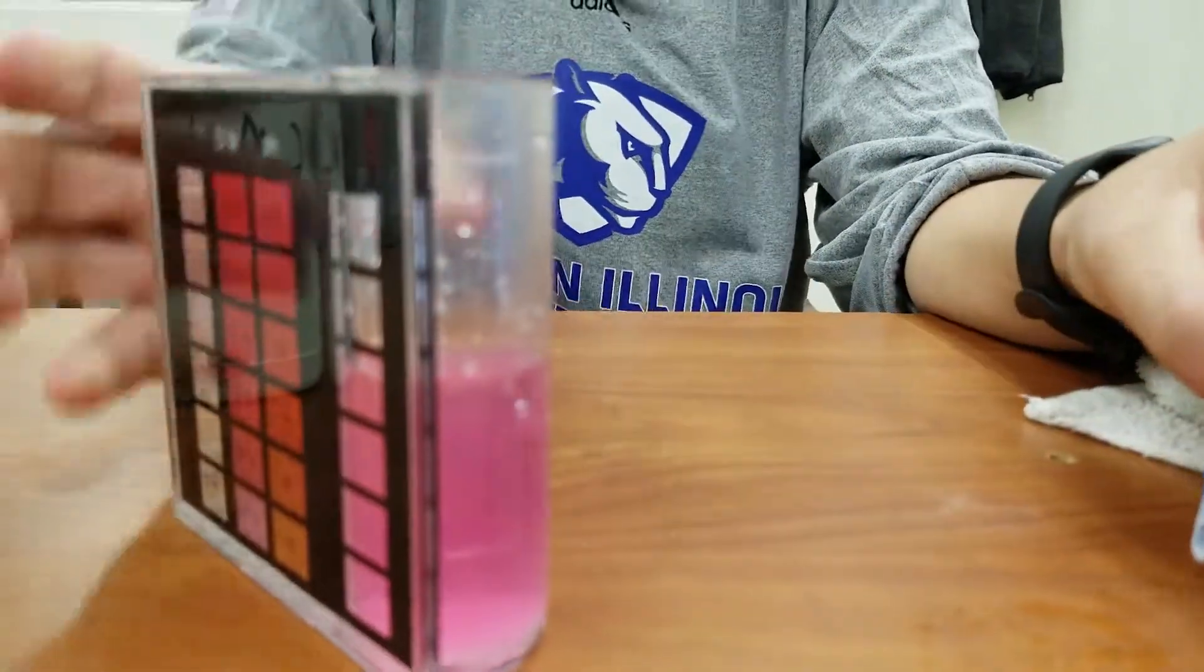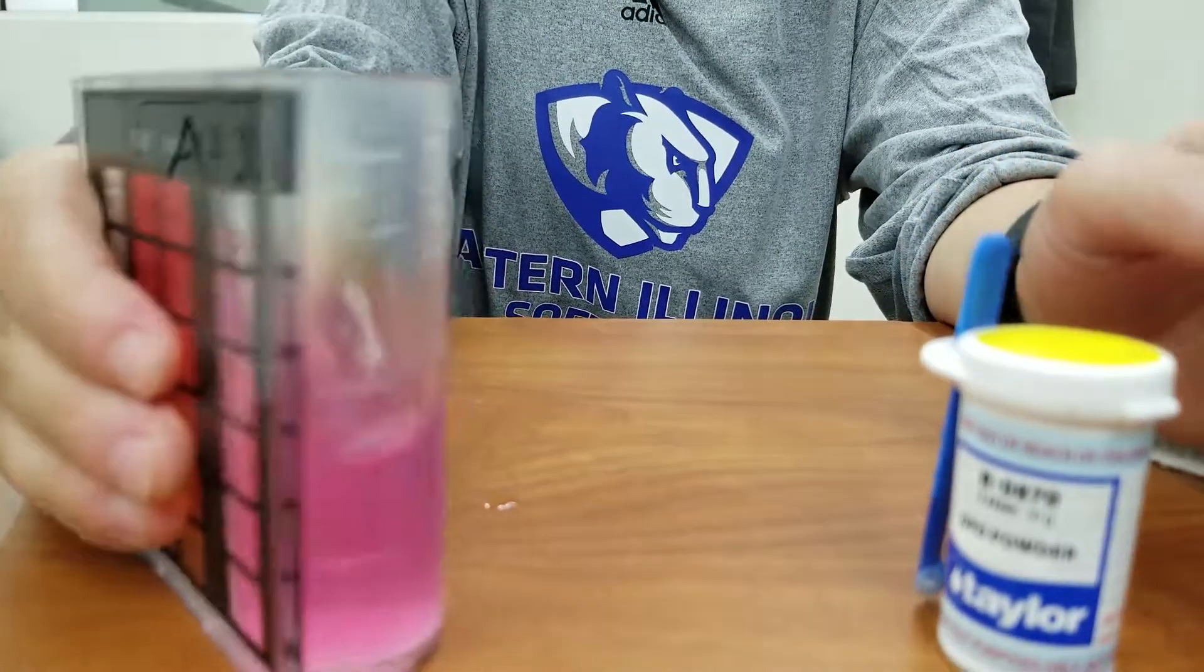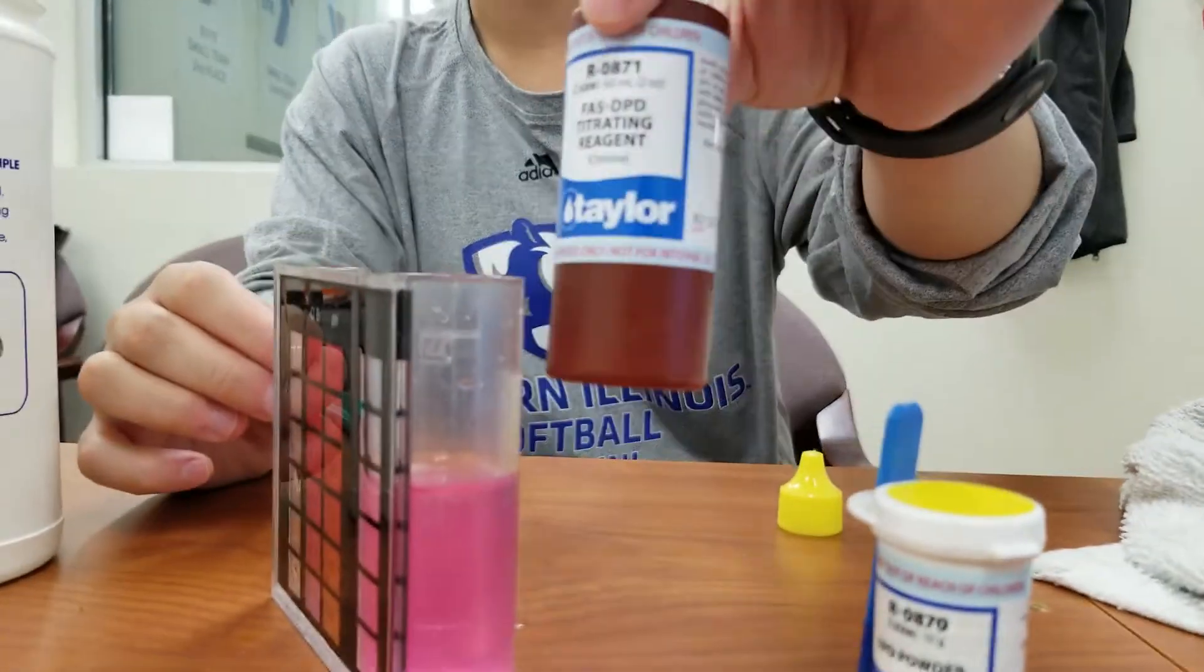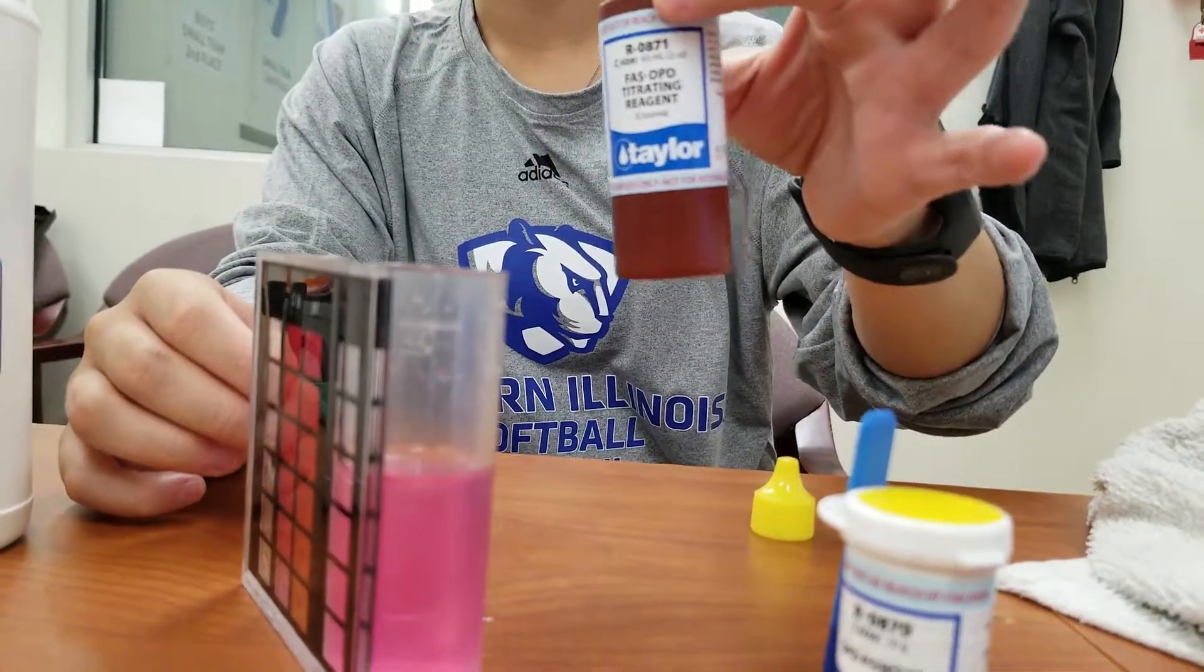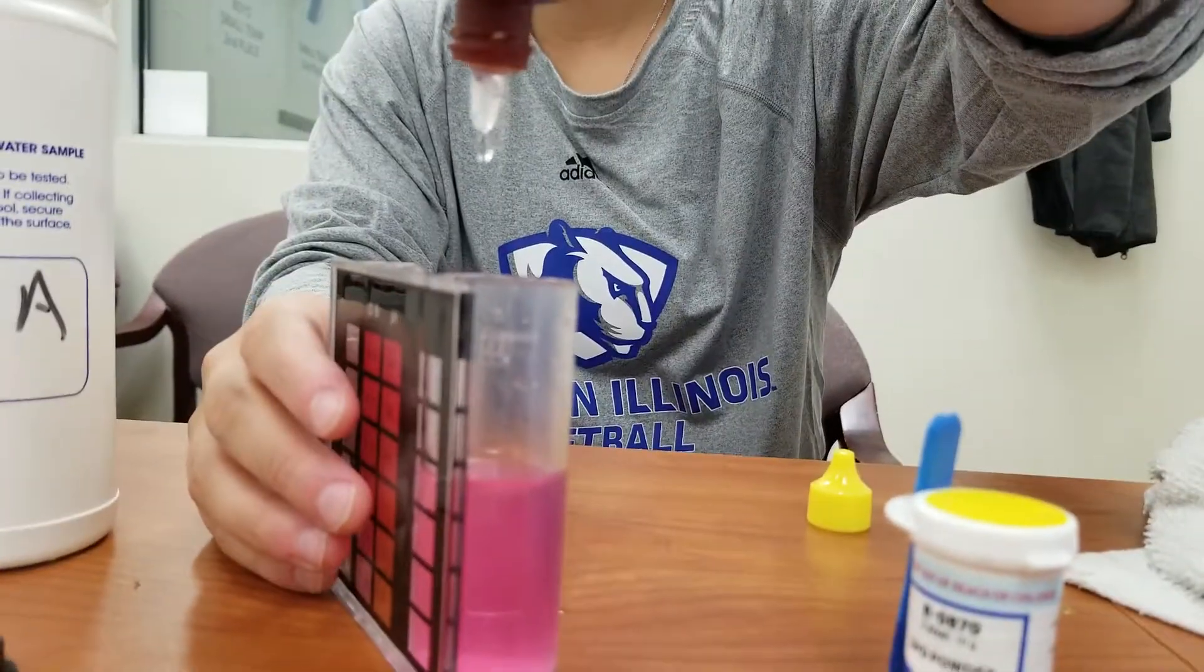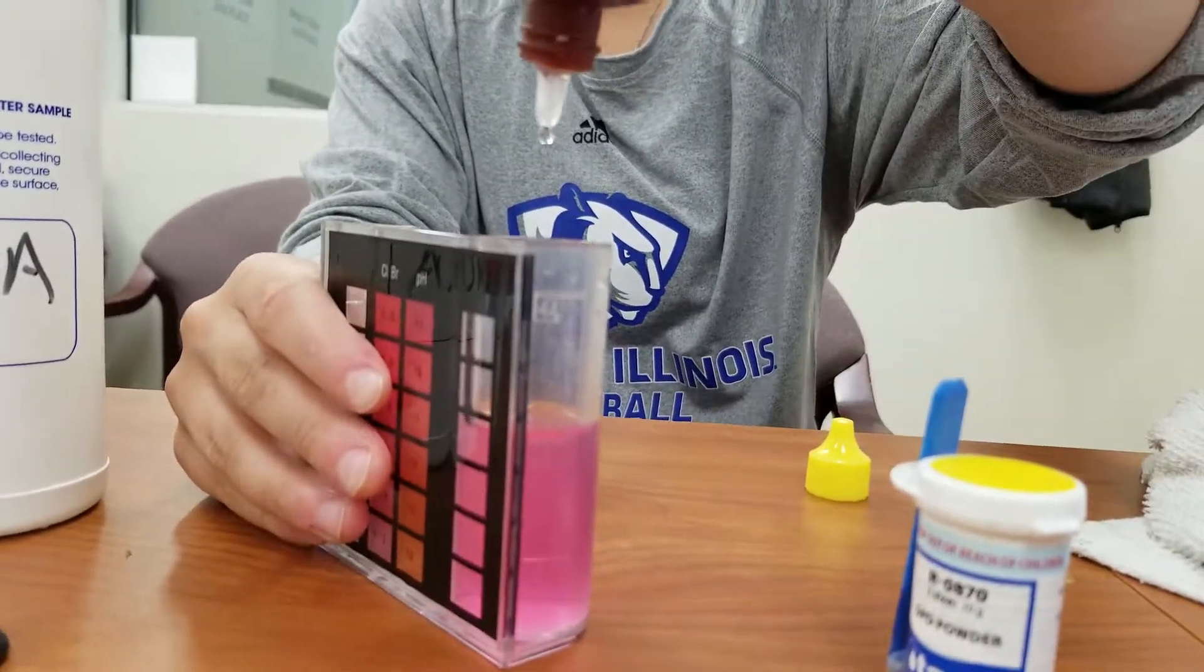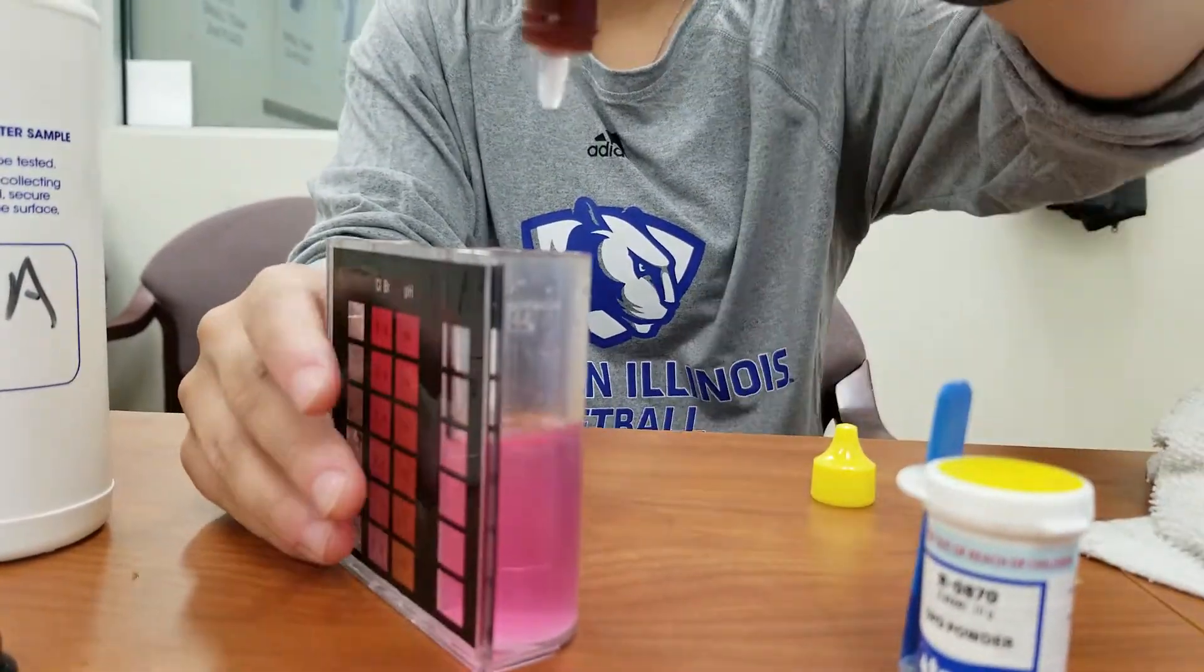So now that we've got that in there, we're going to swirl it around, and it's going to be nice and pink for us. So now here's the titration. We're going to take R0871 and we're going to add it drop-wise. So you drop one drop at a time and swirl. What we're looking for here is a complete color change.